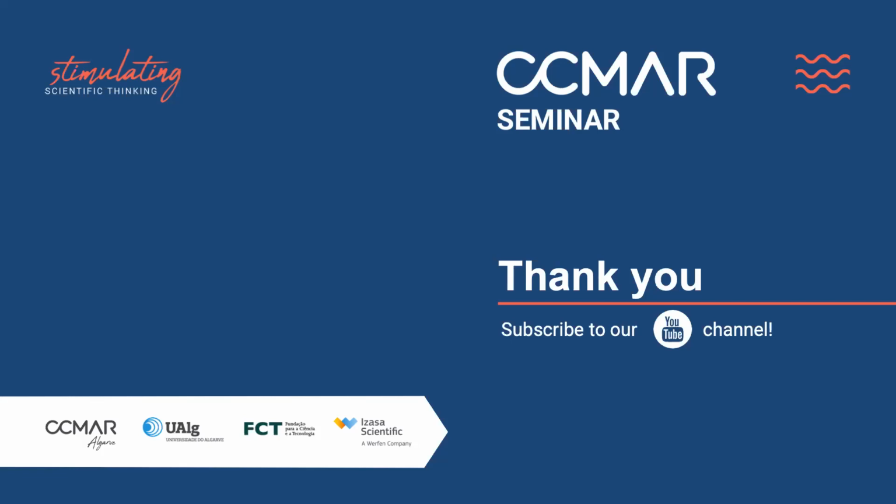Okay, I think that means that it also depends on the type of microplastics that we are using to study. Yes, it depends on the type of microplastic. And also, for example, for PVC, as far as I've been seeing in literature, there is no good compound to identify PVC in a pyrolyzed sample. It depends really on the compound. Yes. Okay, thank you. Thank you very much.